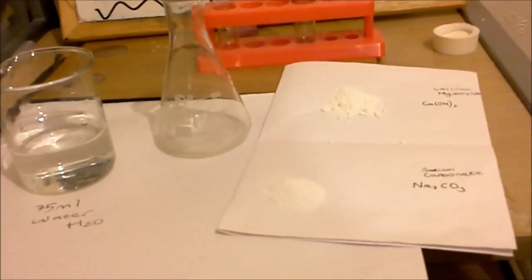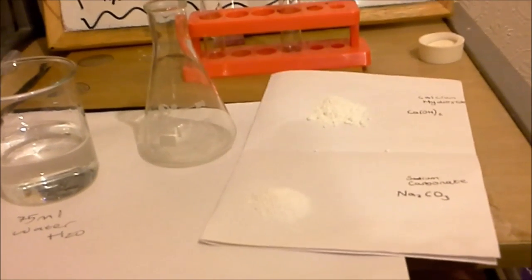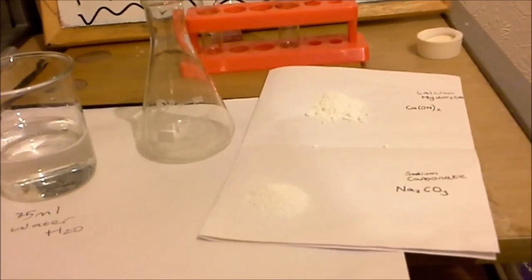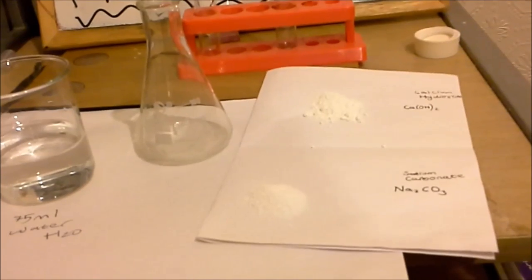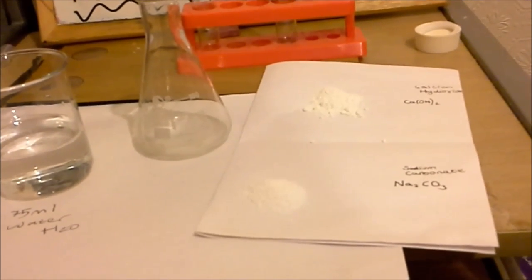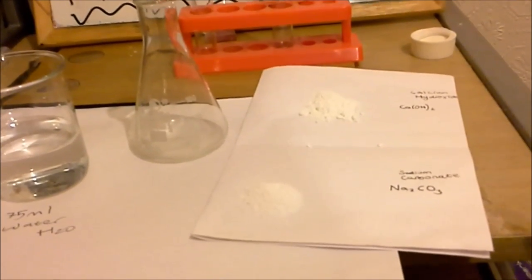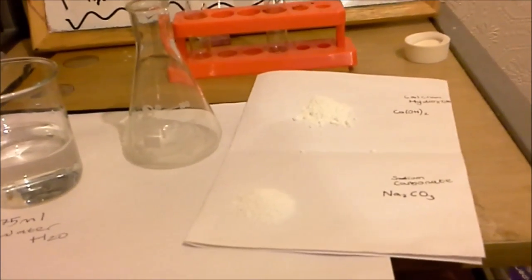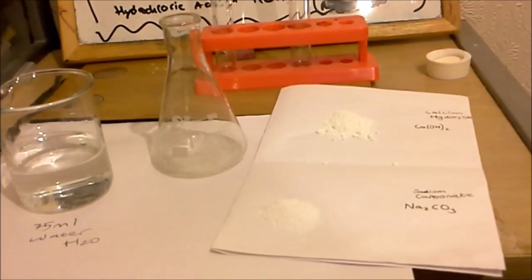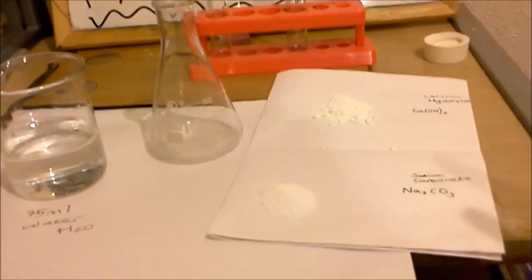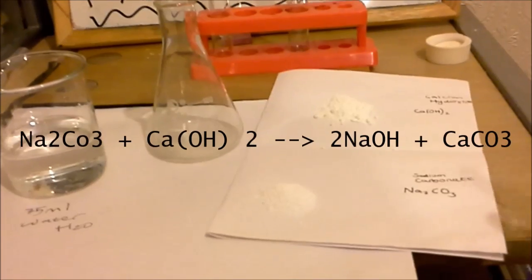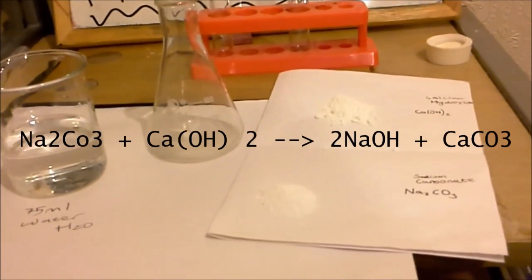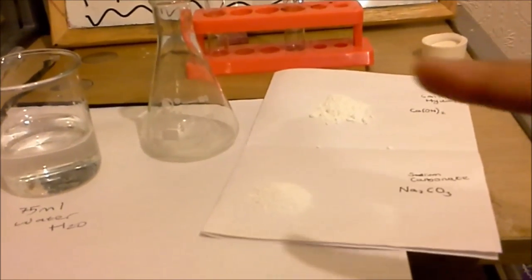So what the procedure is, pretty simple. We're going to get some sodium carbonate and calcium hydroxide and they're 6 heaped spoons each. As you can see like small spoons and then we'll have the water. So we're just going to mix these, they're not chemically combined, we're just going to mix them and then pour them into this flask that we have over here.